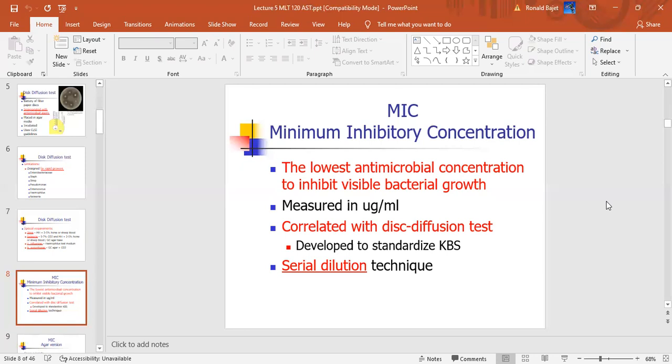So this tube here, where this concentration is your MIC, the minimum inhibitory concentration that will inhibit the growth of bacteria. You see that? Lowest concentration, of course, you're going to get growth. Still low concentration, but it's getting stronger, but not strong enough to inhibit growth. Here, concentration is getting stronger, but you still see some bugs growing.